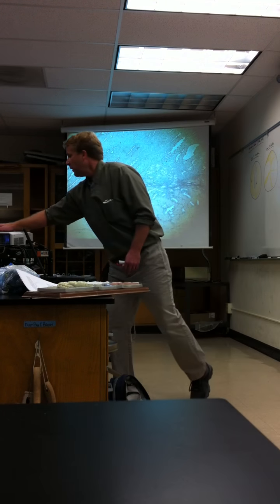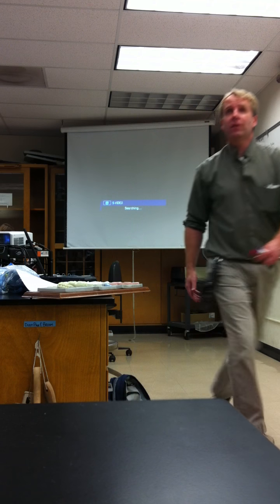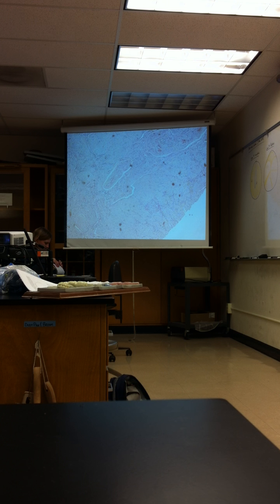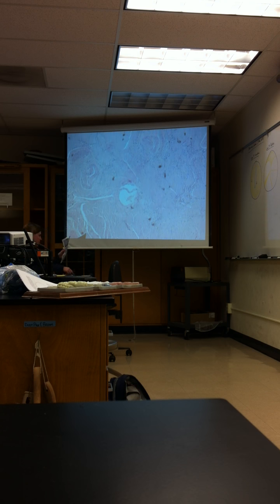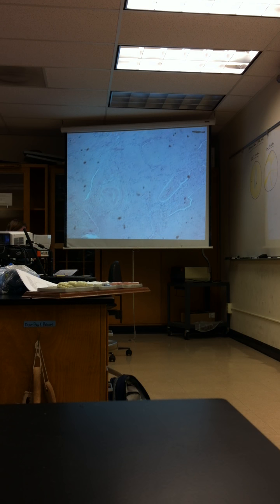What I'm going to do is just so you can appreciate, and you can do this with your own slide, but appreciate how much more myometrium there is. So all of the pink there, this is at low power looking at the uterus slide, and all of that pink is myometrium. It's all smooth muscle, and I'm just going to move it up, and you can see how much more myometrium there is than the endometrium. So this is all myometrium, still myometrium, still myometrium.